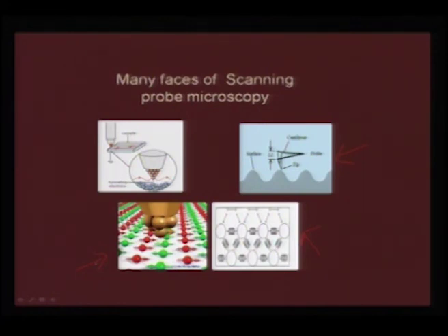We can study spin polarized tunneling also. So, any sort of images can be made. I have particularly avoided showing some classic examples where you can even probe biological samples, but for our course it is important to understand that any sort of inorganic materials can be mapped using STM.